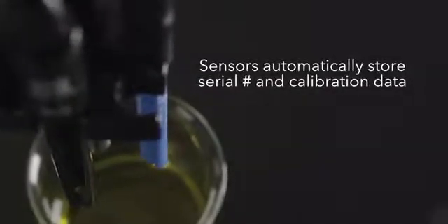The intelligent digital sensors, or IDS sensors, automatically store their unique serial number and calibration data. In addition, they digitally process the measurement signal.